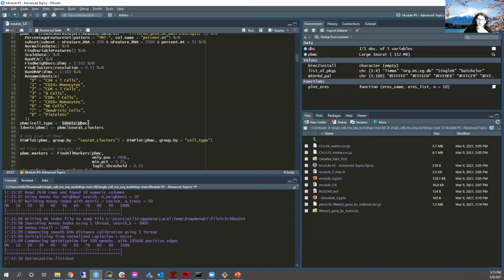Okay, so the reason, oh, okay, yeah. Sorry, I jumped in too early there. All right, so yeah, so we don't lose the labels.